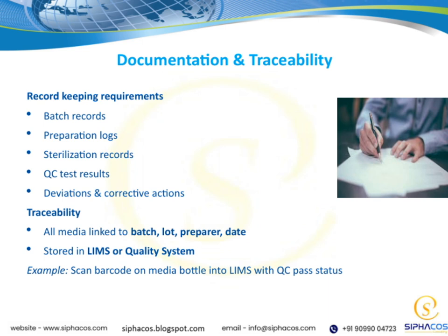Traceability is a core concept here. It's about linking all media to specific batches, lots, preparers, and dates, creating a clear audit trail. Typically, this information is stored in a laboratory information management system, or LIMS, or within a broader quality system. For example, you might scan a barcode on a media bottle into the LIMS, which automatically records the pass status of the QC test, ensuring quick, accurate traceability.